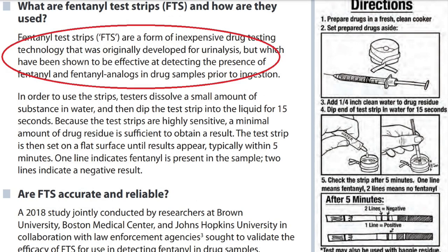And to the person who asked me about fentanyl reagent tests, such a thing exists, but all the ones that I found were commercial products. Because of how the tests work, it's just not possible to produce this kind of thing at home.